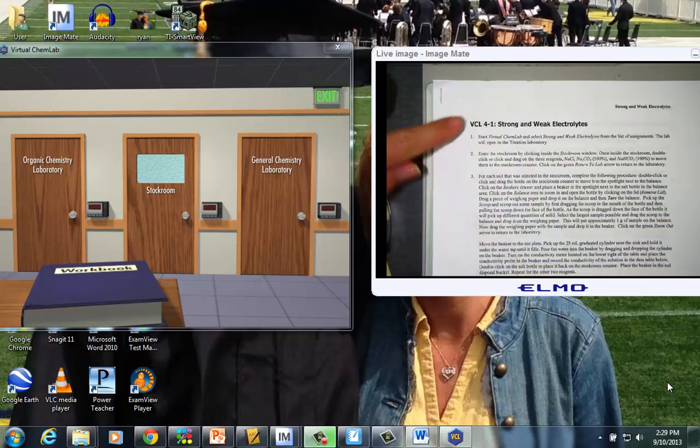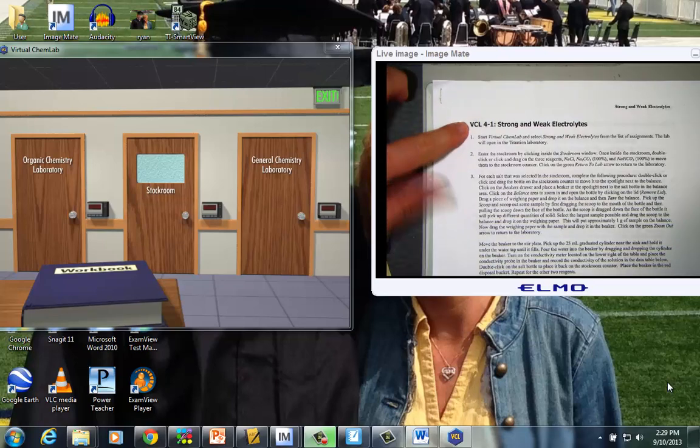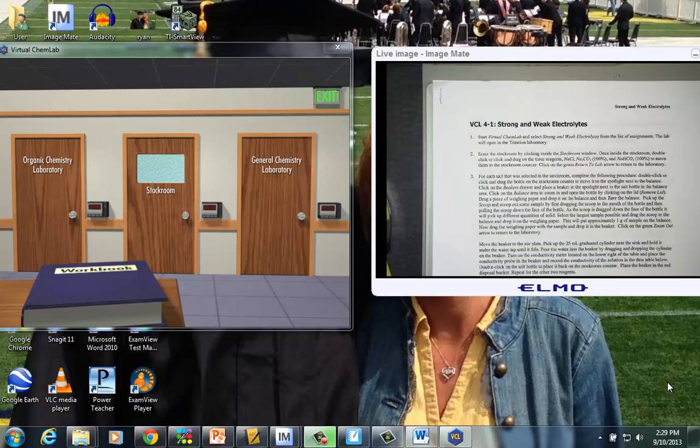In this video lesson, we're going to be looking at strong and weak electrolytes. And what we'll end up doing is just kind of walking through a virtual chem lab. Since it's our first practice, I wanted to walk you through an example.